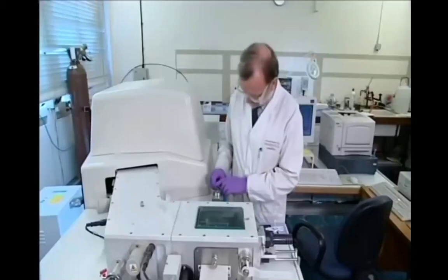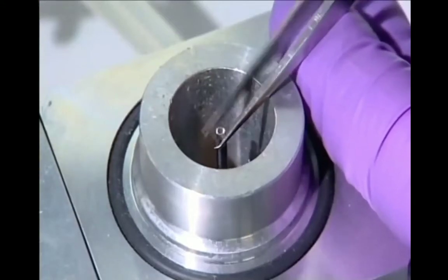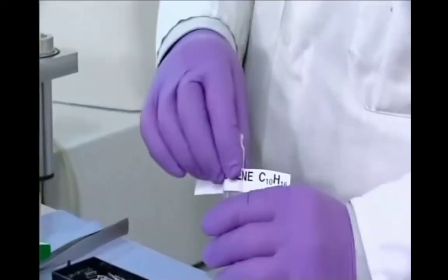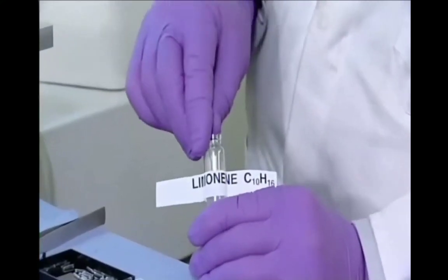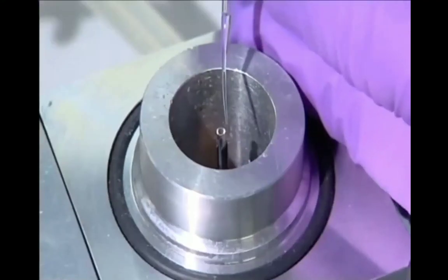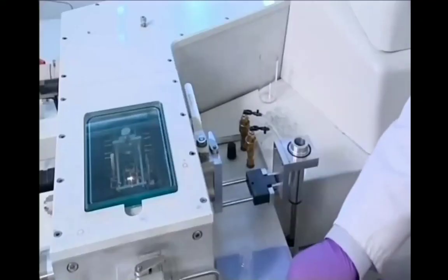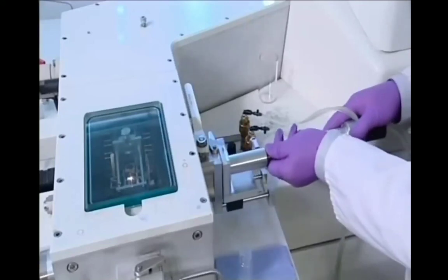Liquid samples are placed in the tiny sample tube as shown. Here, we're running the mass spectrum of limonene, an alkene which can be obtained from the peel of citrus fruits. Only a little is required. Mass spectrometry can detect down to as few as 10 to the minus 12 moles. Volatile samples can be run neat. Less volatile ones are dissolved in a solvent such as dichloromethane, which then evaporates.